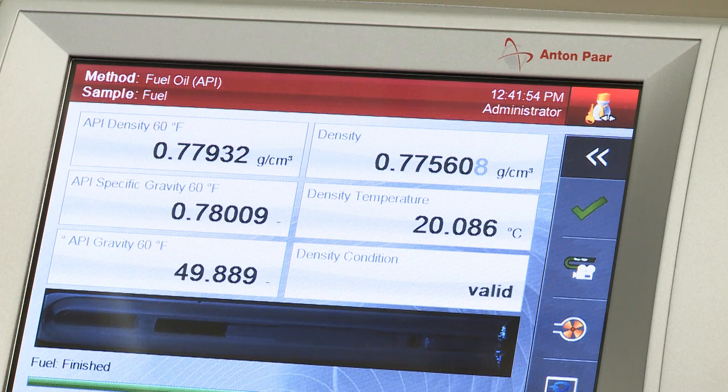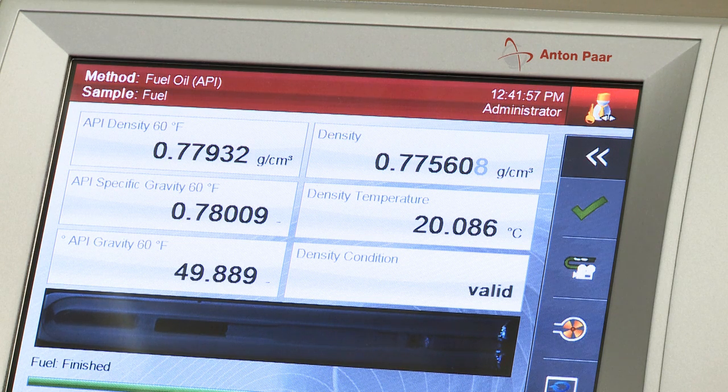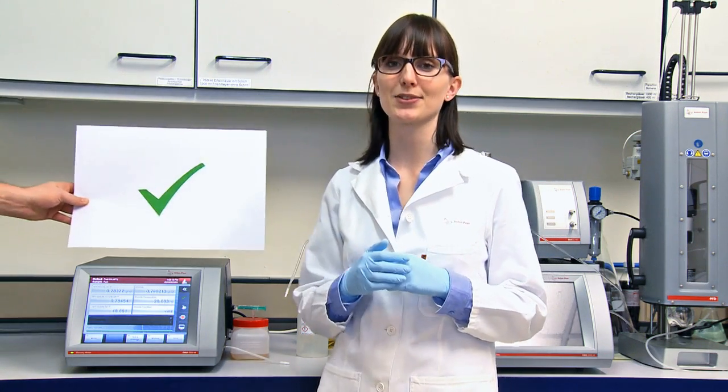And here we have the results. What does that green check symbol mean? That means that the filling has been checked and approved.